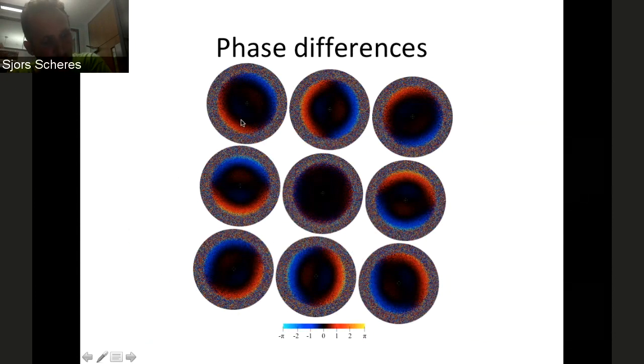So for each stage position, you take an image in the central hole, which will have very little beam tilt, and therefore the systematic differences in phases between the Fourier components, that's what we're looking at here in negative blue and positive red and yellow, are more or less absent when you take images in the central hole. But if you shift the beam upwards all the way to the next hole, then you introduce these phase differences in the direction perpendicular to that shift. So you get positive phases on one side of the spectrum and negative phases on the other side.